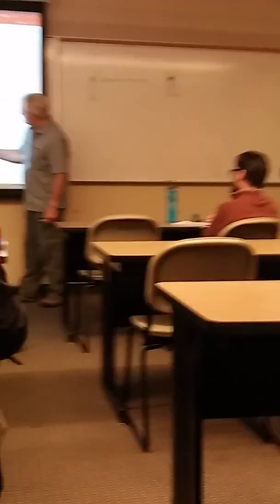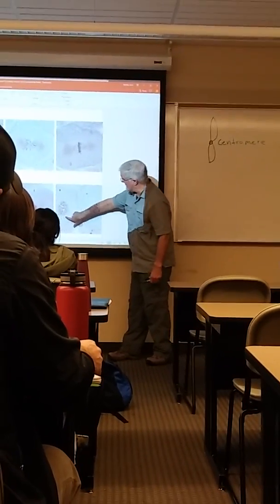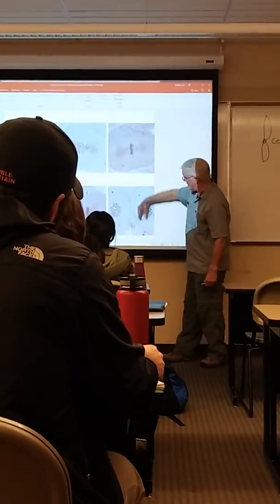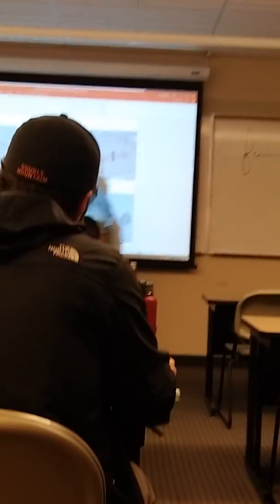Over here, though, they're less condensed than these guys. They're definitely more spread out. I can't see a nuclear membrane yet, but I can see the formation of cytoplasmic membrane between these two. So it's easy to kind of tell where you are in our mitotic process.